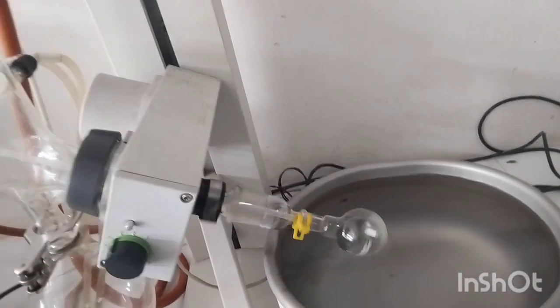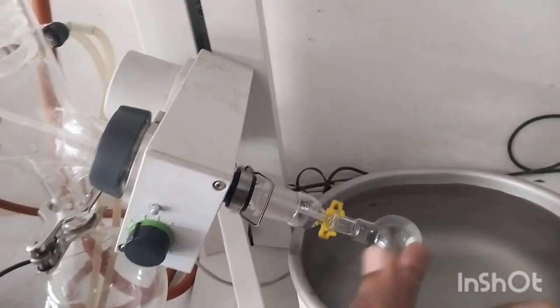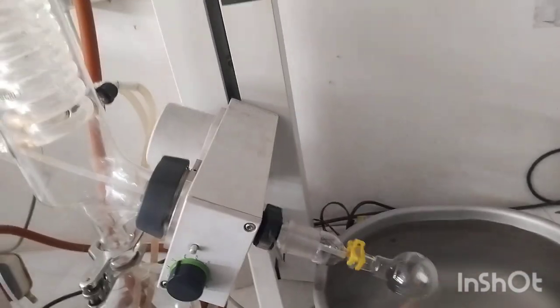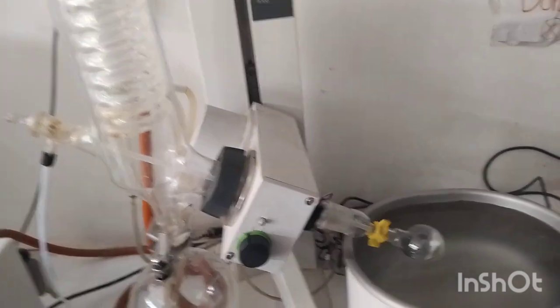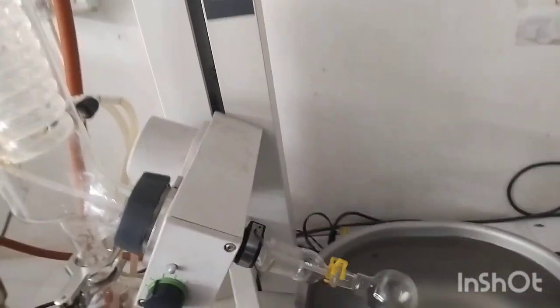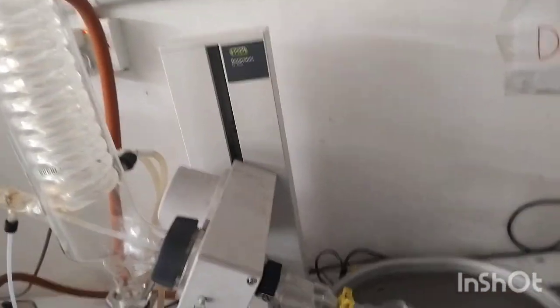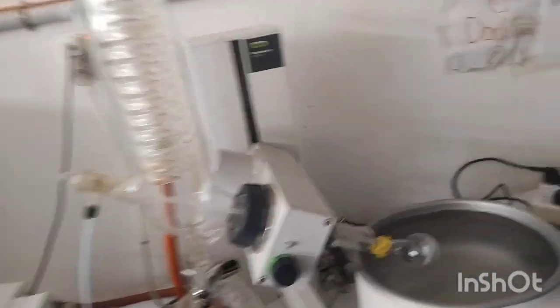And if you'd like to dry properly, then you have to use chloroform, so that properly drying will be done. At first, when the reaction is done, we have used chloroform, and we have used this system, and when the solvent is about to end or complete, then we have again used chloroform, so that overall drying is done properly. And the next one, we will use silica, so that the drying of our mixture will be really awesome. So that's it, guys.